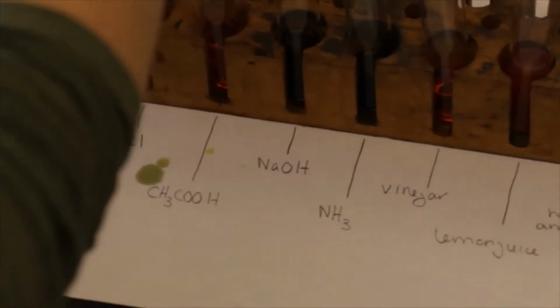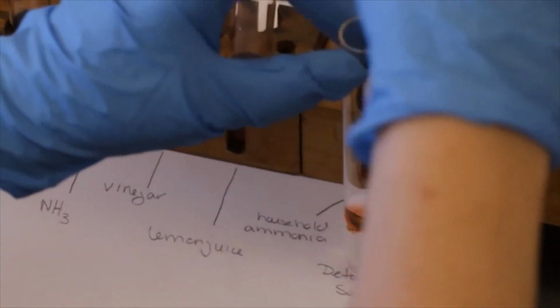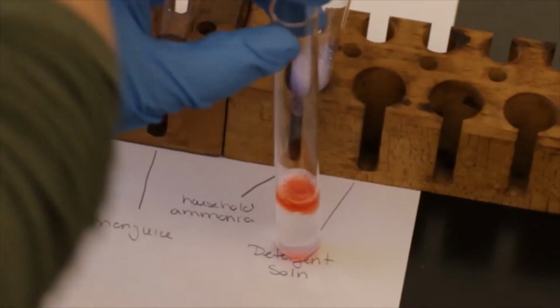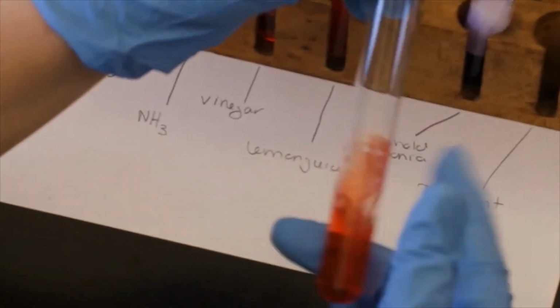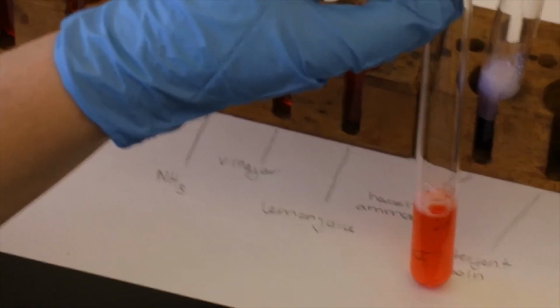Now if we try the detergent solution, that is our hand soap. Put a few drops in. And we're going to mix this up. Our hand soap, surprisingly, is a little orange.